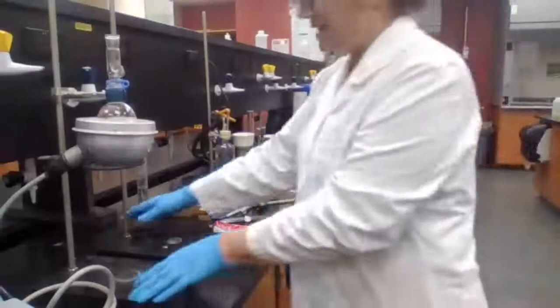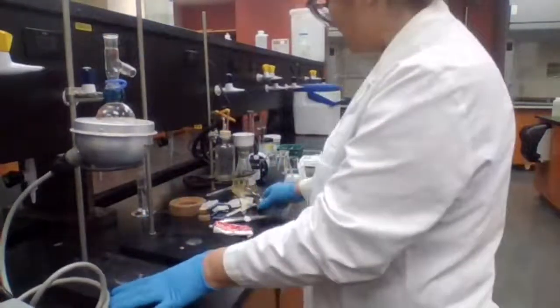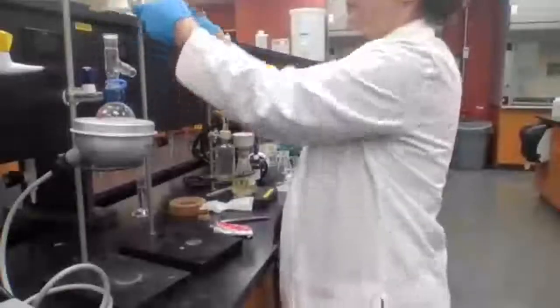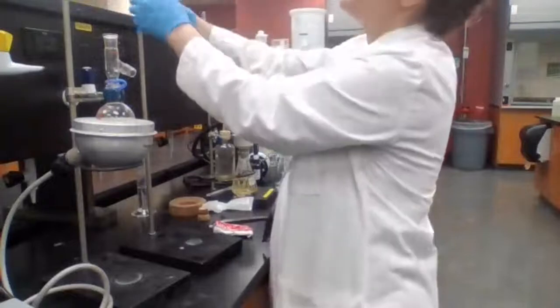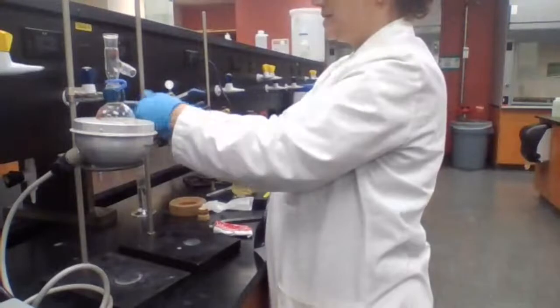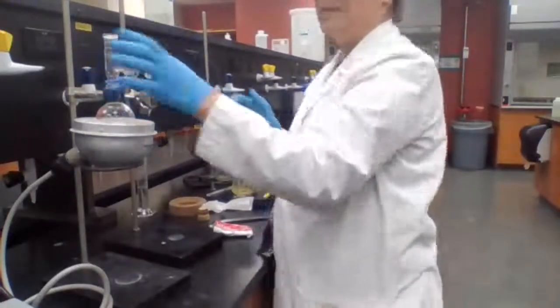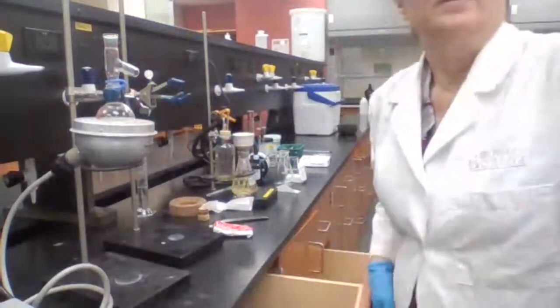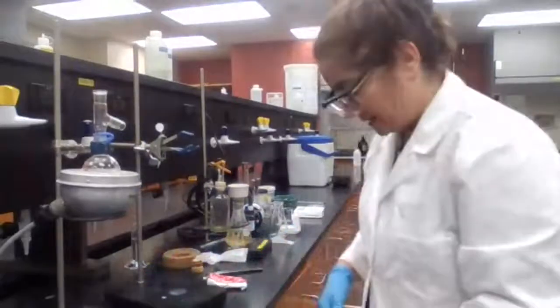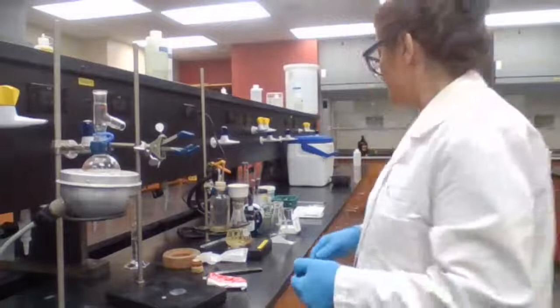What is the next piece that I need for distillation, to set up my distillation? What's the next piece? Can you tell me what's my next piece? The glass piece that is missing? The setup for simple distillation. What is missing? A condenser.